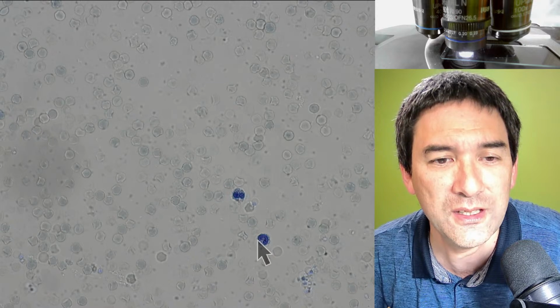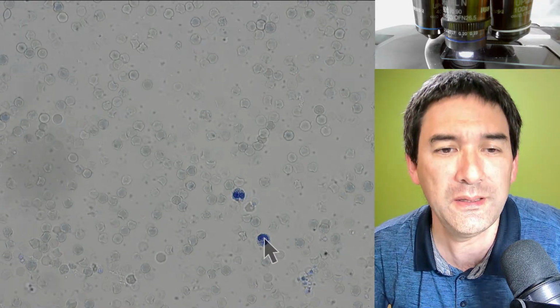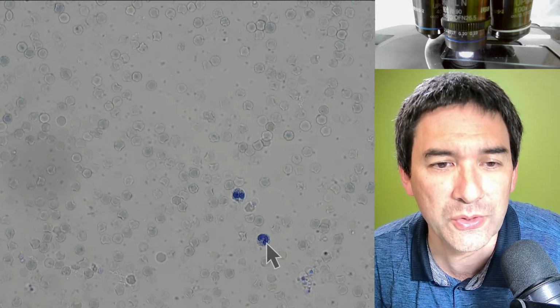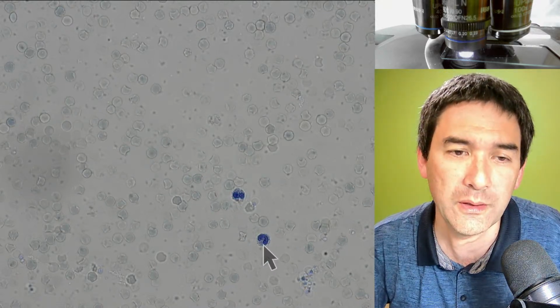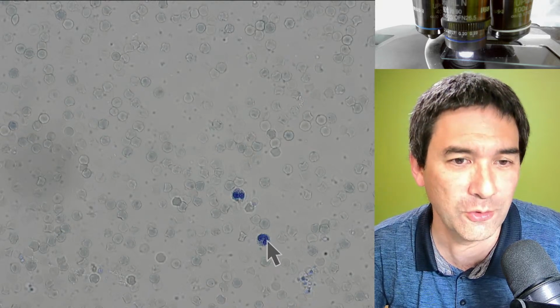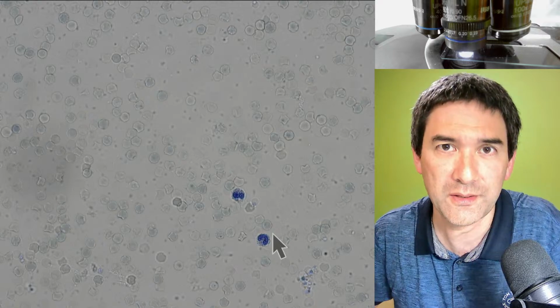Do you actually see that here the nucleus is kind of bent? That's also something that you sometimes are able to see, and sometimes you're even able to see that it's not just bent, but there are actually 2 or 3 lobes. Polymorph nucleated granulocytes, I think they're called. Polymorph meaning having different shapes.